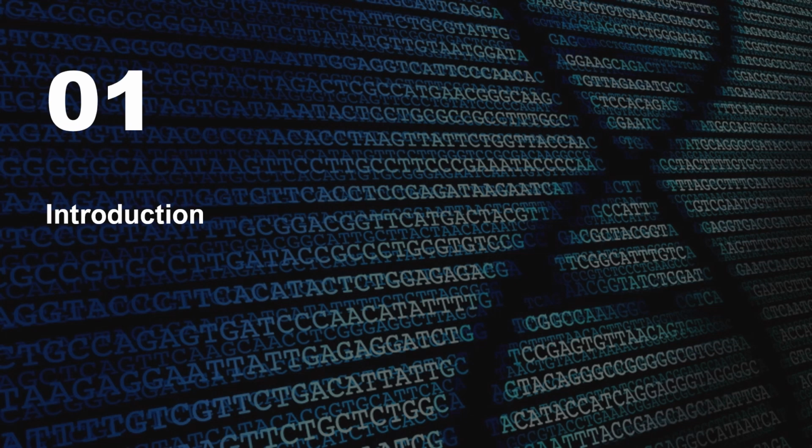We'll start with a brief introduction to nanopore sequencing, how it works, and the recent advancements we've made to our technology to improve throughput and accuracy.